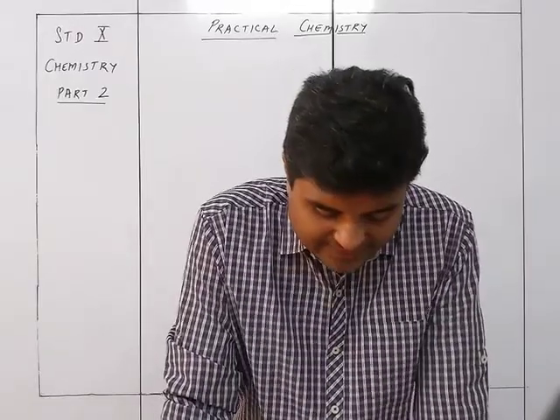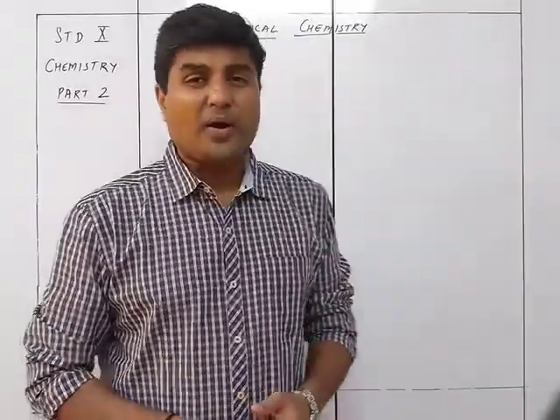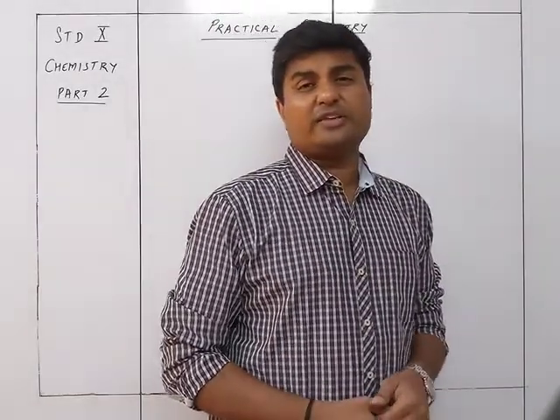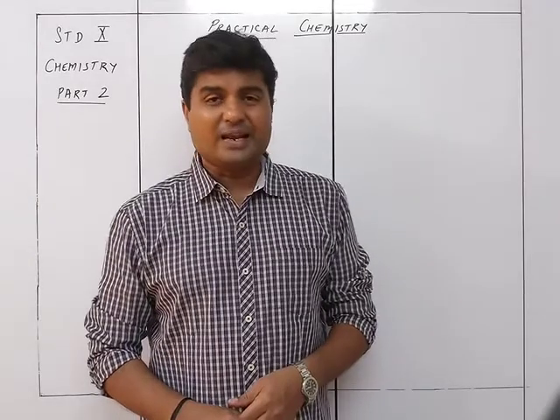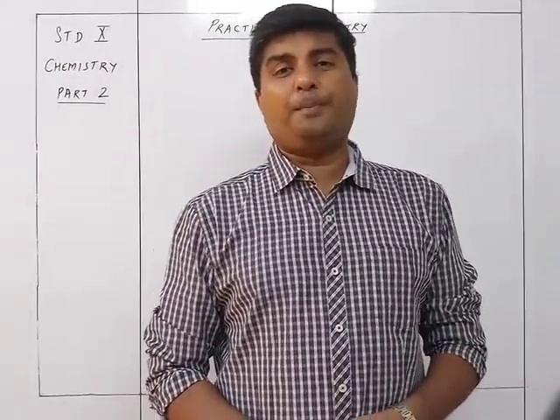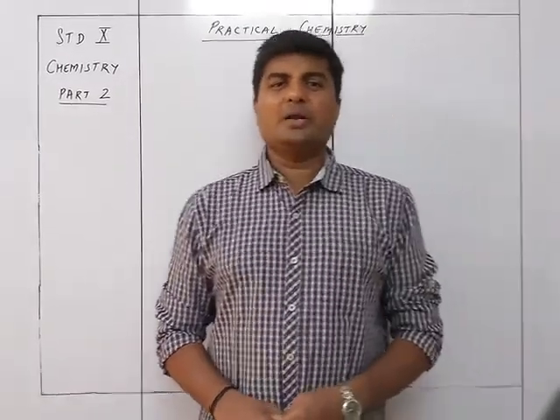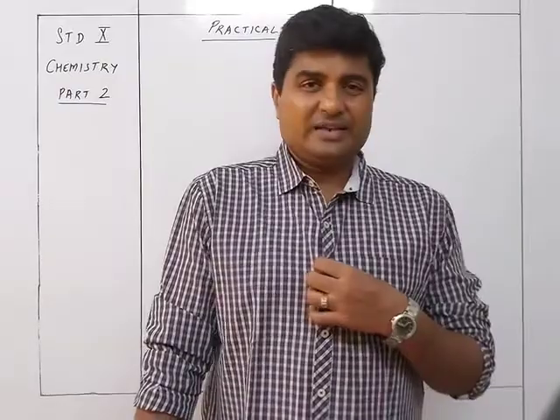So this is Nessler's reagent turning. Of course, the reaction is not important. What is important is the original color of Nessler's reagent. Nessler's reagent is originally colorless and on passage through ammonia becomes pale brown. The pale brown color of Nessler's reagent on passing ammonia is a test for ammonia.